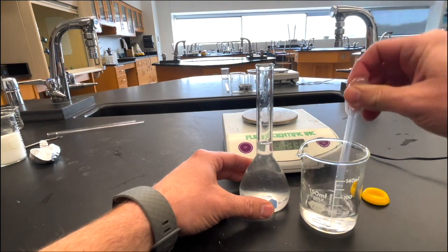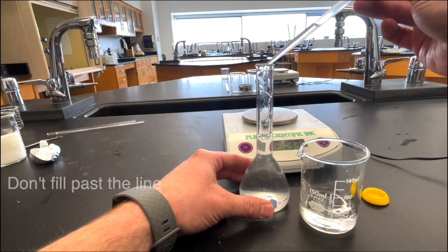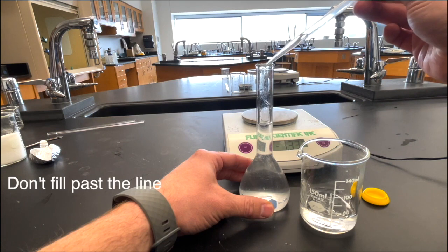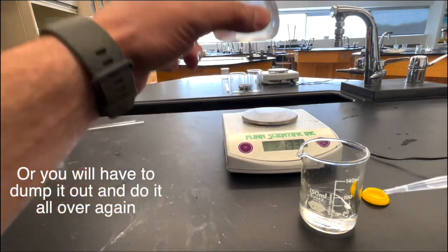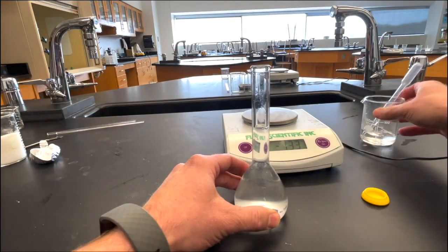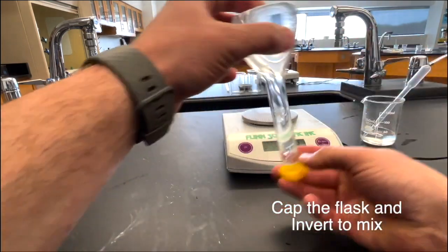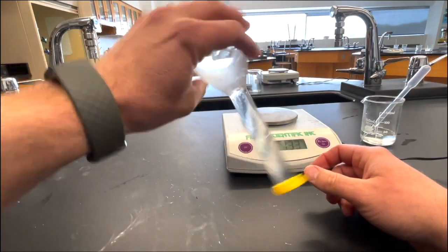And this is where I'm going to take a pipette and add that last little bit of liquid, so that I can get up to the line, making sure the bottom of the meniscus touches the line but not going past. If you do happen to go past the line, you are going to have to dump out your solution and start all over again. If your liquid goes past the line, you actually have less concentration than you think you have.